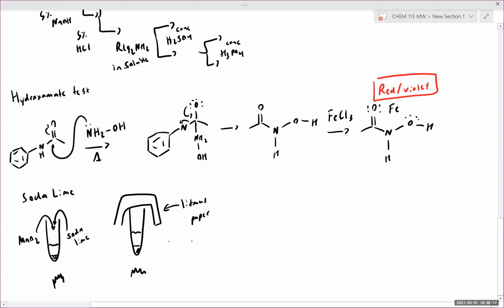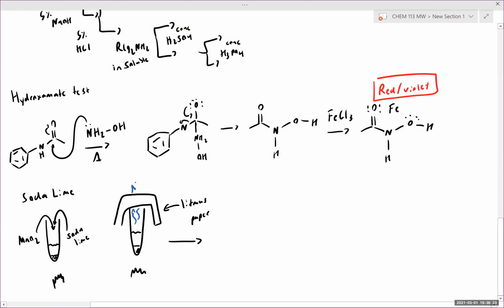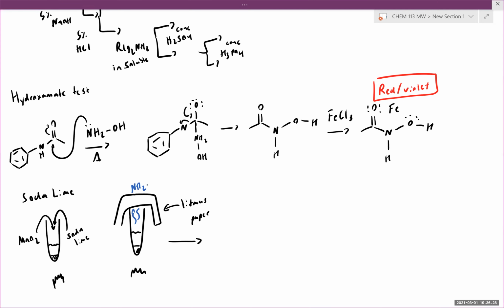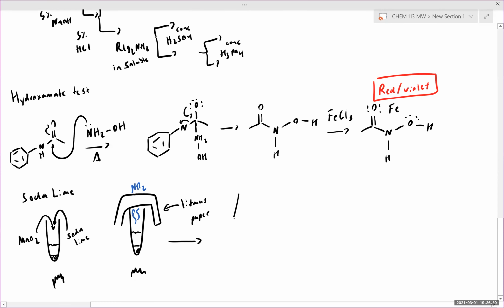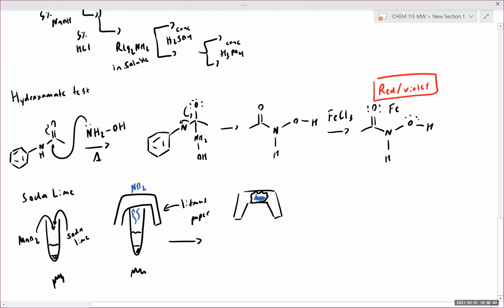And what's going to happen is as the reaction proceeds, we're going to be generating ammonia. So as a result, what you will see is that the litmus paper over time in this reaction will start to change color. And this observable color change indicates that ammonia was generated.